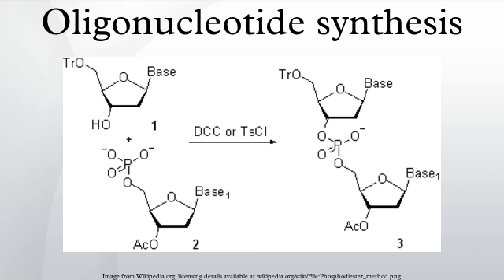Step 3. Capping. The capping step is performed by treating the solid support-bound material with a mixture of acetic anhydride and 1-methylimidazole or, less often, DMAP as catalysts and, in the phosphoramidite method, serves two purposes. After the completion of the coupling reaction, a small percentage of the solid support-bound 5'-OH groups remains unreacted and needs to be permanently blocked from further chain elongation to prevent the formation of oligonucleotides with an internal base deletion commonly referred to as shortmers. The unreacted 5'-hydroxy groups are, to a large extent, acetylated by the capping mixture.